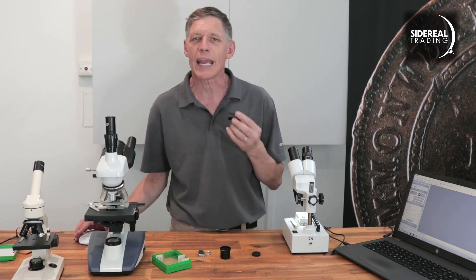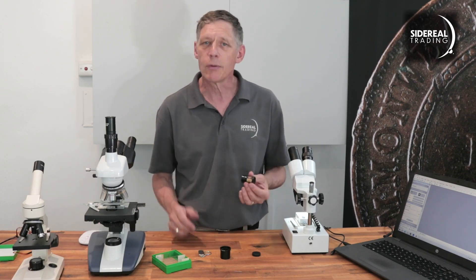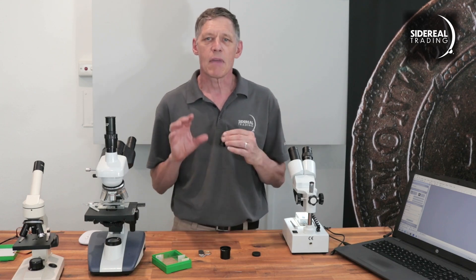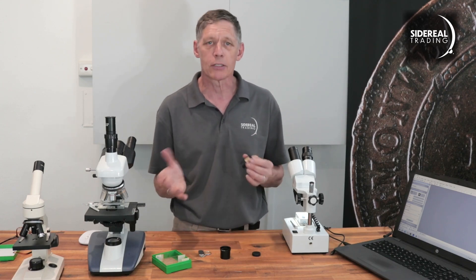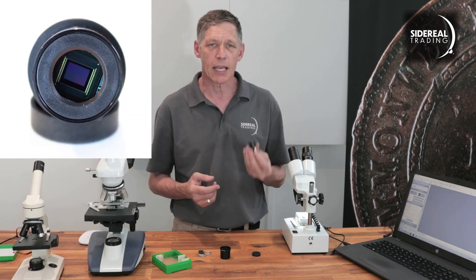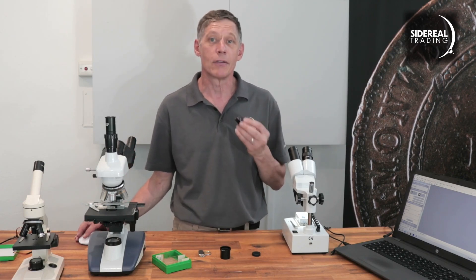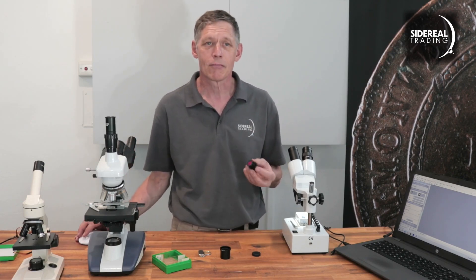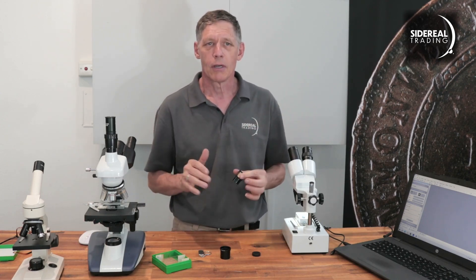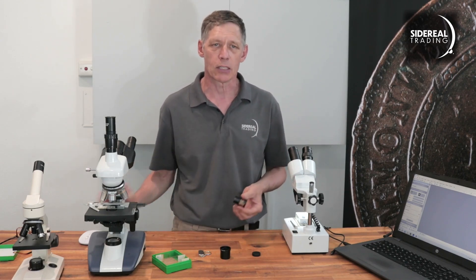Astrophotographers like to talk endlessly about the details of their sensors, but for this camera it's not quite so important. The physical size of the sensor does affect the field of view — that is, how much of the slide or specimen you're going to see on the computer. This sensor is 5.7 by 4.3 millimeters. It's 5.1 megapixels, which is equivalent to four HD computer monitors, meaning you can zoom in digitally a reasonable way without your image starting to pixelate.